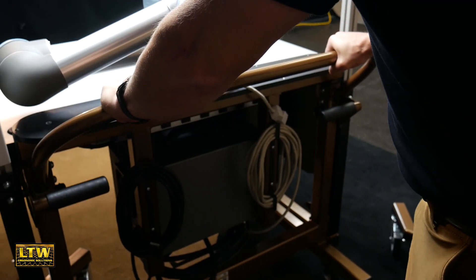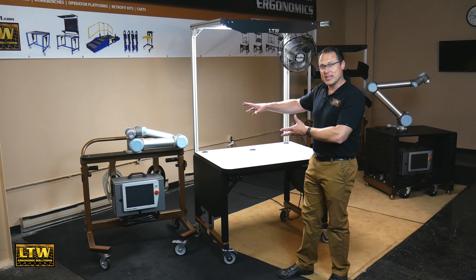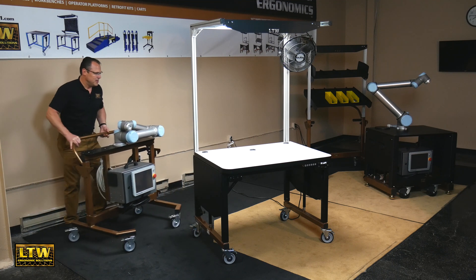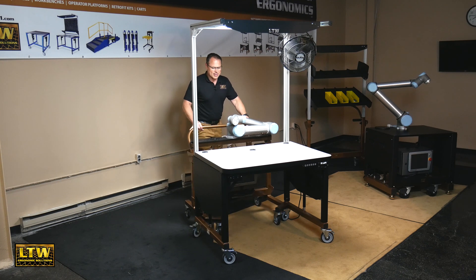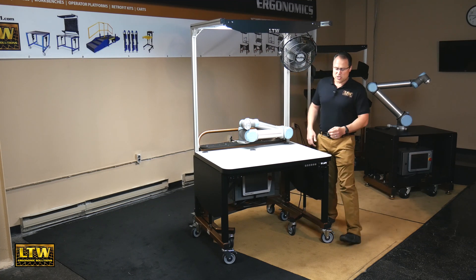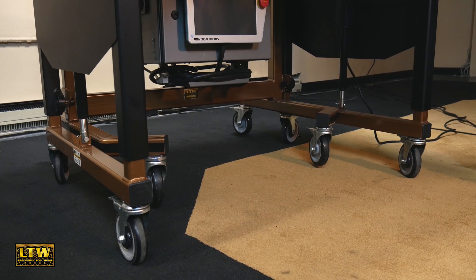In this case, the trolley has a universal robot adapter kit and a universal robot mounted to it. Now you can easily wheel this trolley to any one of your RCT workstations throughout your plant, wheel it into the backside, and lock and dock it into the back.